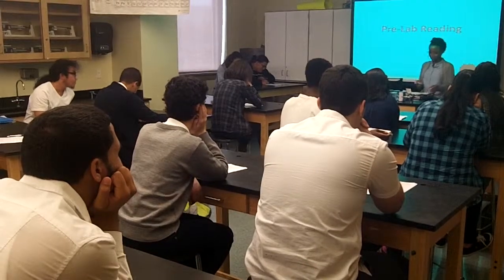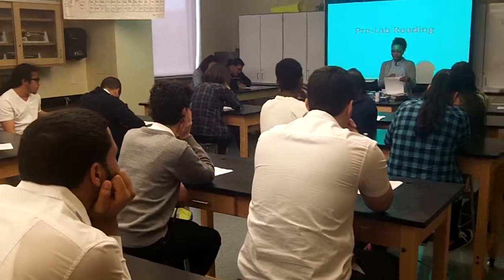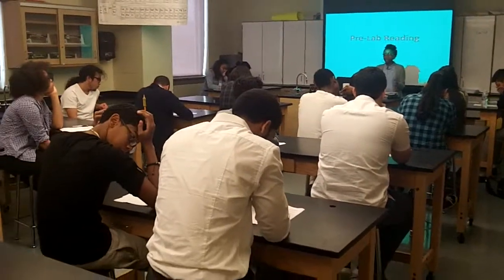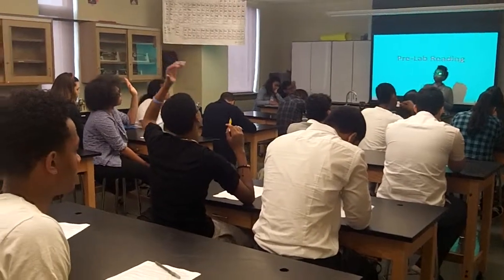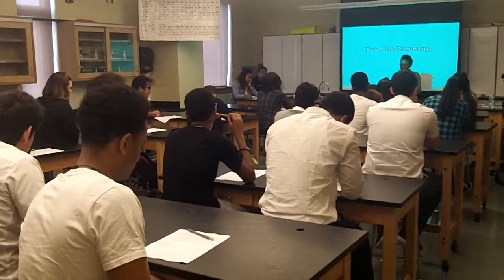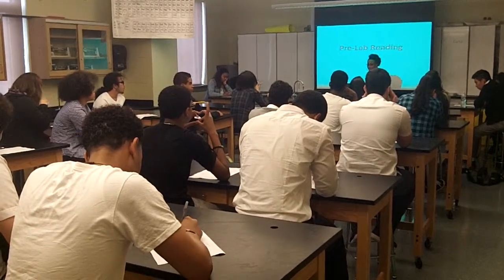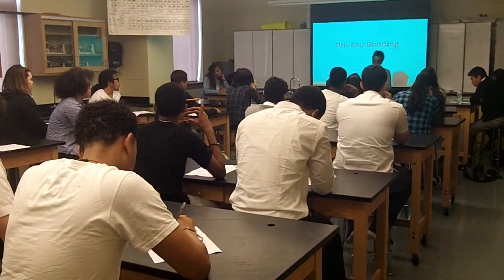So we have a long balanced reaction here, but we know that, look, it says that we're reacting sodium bicarbonate, which is a base, and it's reacting with citric acid, an acid. What is the product of an acid-base reaction? Somebody with a hand. What is the product? Elena? Salt and water. Salt and water, of course. So today, we are going to be conducting an acid-base reaction inside of these beakers. Now, to understand this acid-base reaction, we need to investigate.